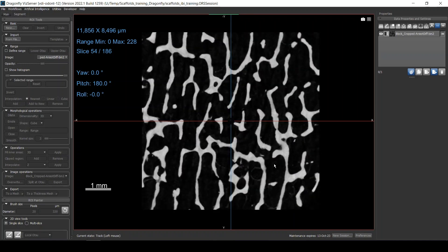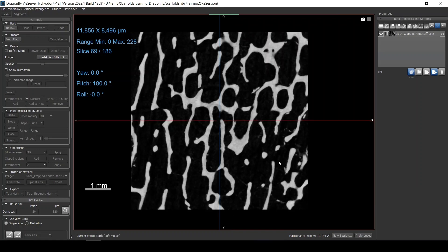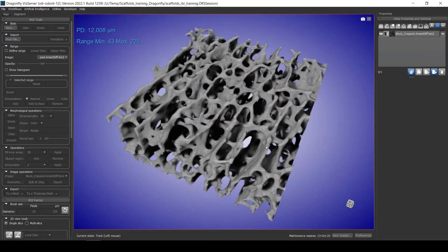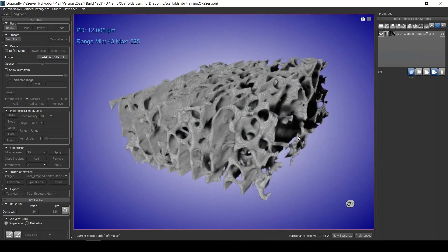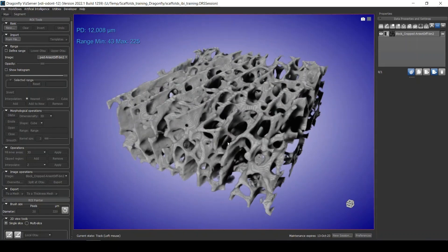This scaffold was scanned in a micro-CT system at 8 micrometers per voxel, and I resampled it to 16 micrometers just to make it easier and faster to present here. So this is just a cropped region that has been resampled.